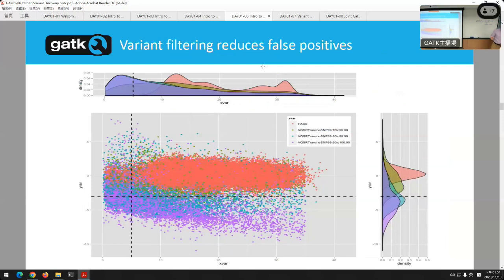Also, what's important is remembering that even though I mentioned that the sequencing data is not perfect, it's definitely not perfect. And we do our best to represent everything, to fix things and reprocess it with recalibration and remove duplicates and just get all the math right. And still, it's not perfect because the human genome is complicated. The sequencing data is imperfect. The mutations get complicated. So there are things that still are hard to catch. But when you look at them with one sample, almost impossible. When you see the same systematic problem across many samples, now you're empowered to do something about it.